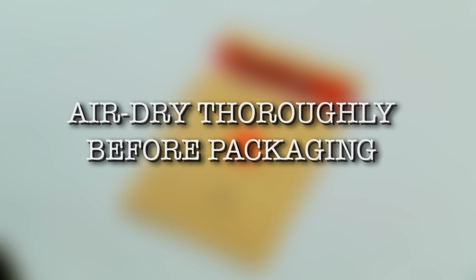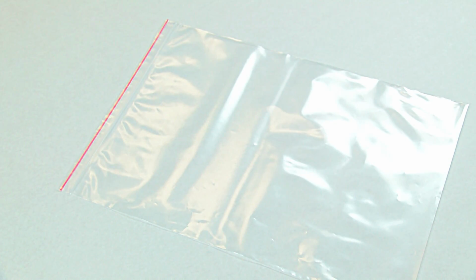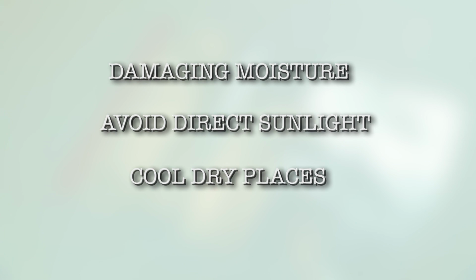Air dry evidence thoroughly before packaging, or place into a container that breathes, such as a paper bag. Never place evidence that may require DNA analysis in plastic bags, because plastic bags will retain damaging moisture. Direct sunlight and warmer conditions may also be harmful to DNA, so it is best to keep evidence in cool, dry places.